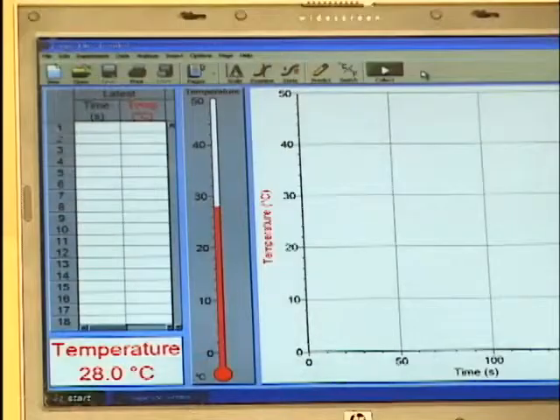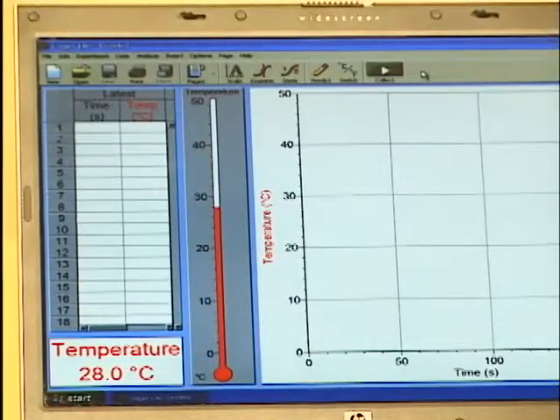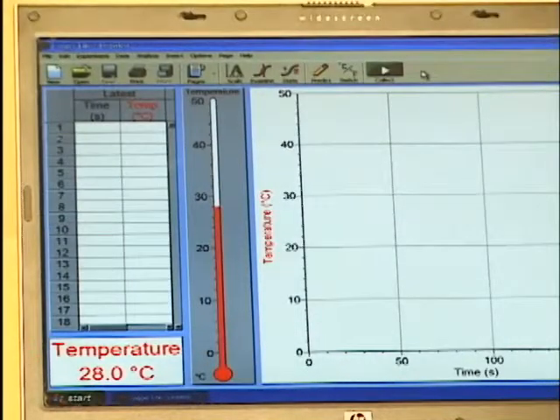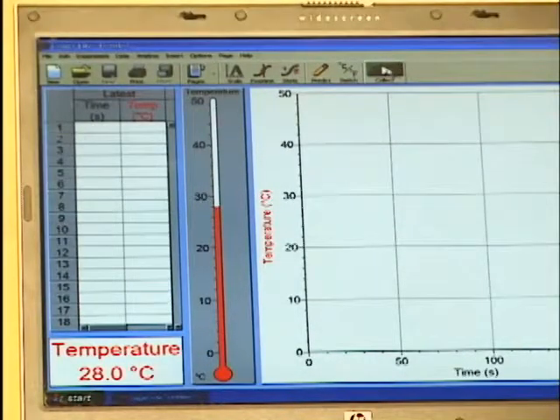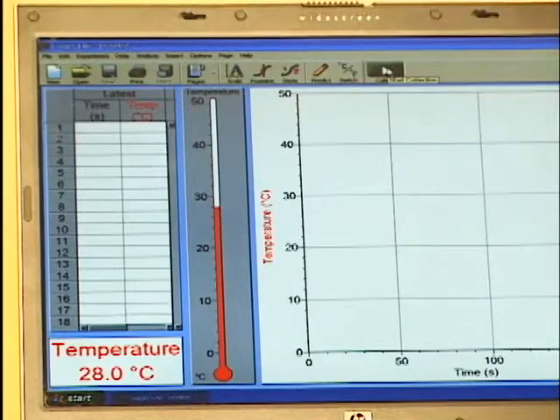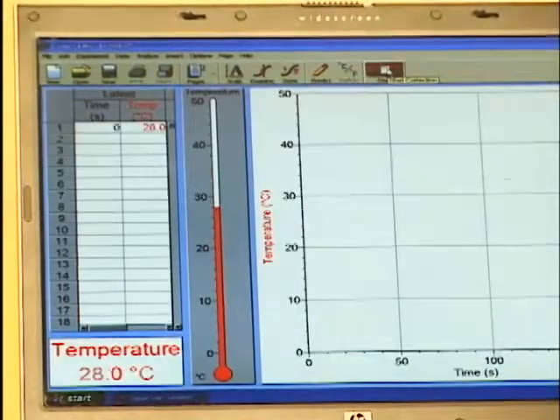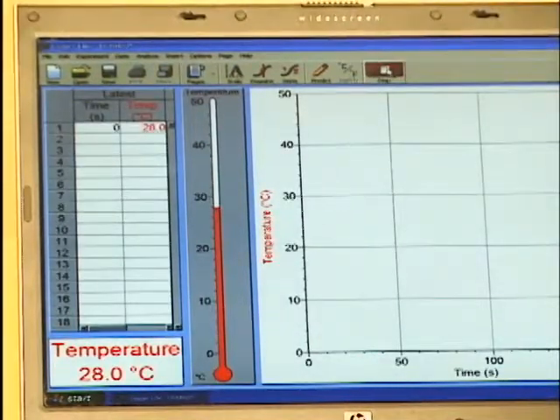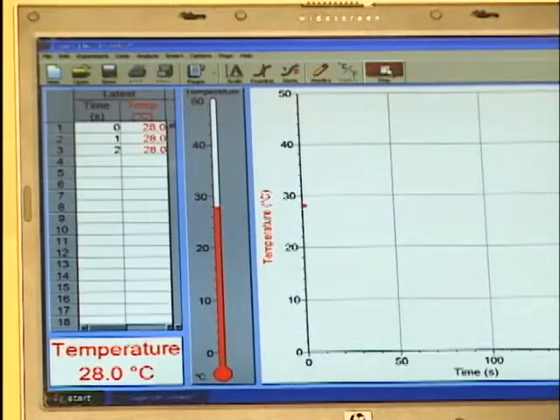You'll notice that Logger Lite has found the temperature sensor, and now we're monitoring the temperature. To start collecting data, we simply click on the Collect button, and now we're taking data in real time.